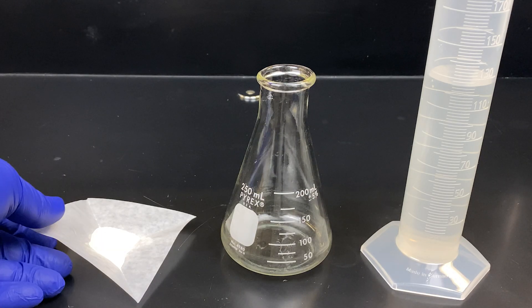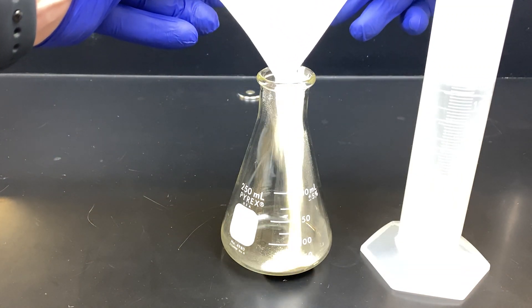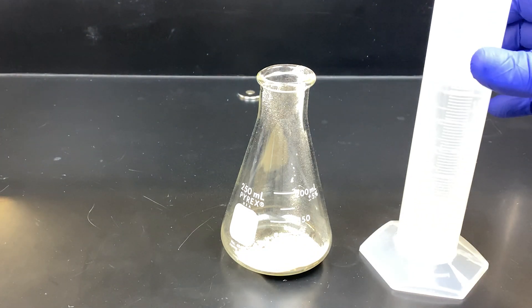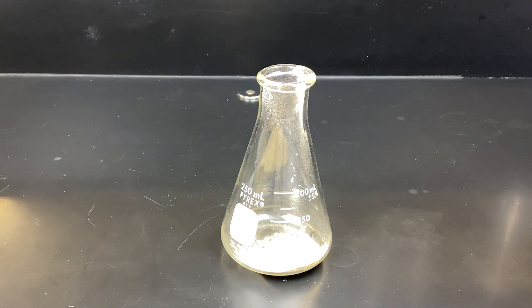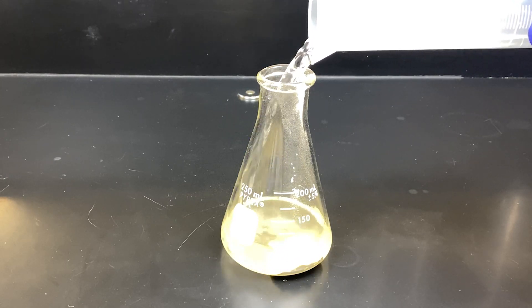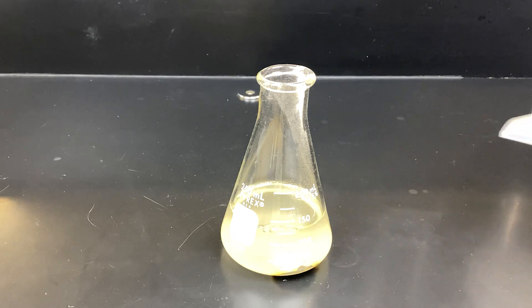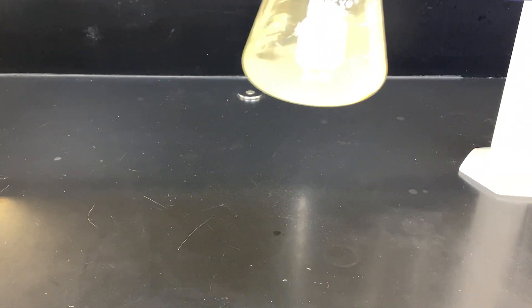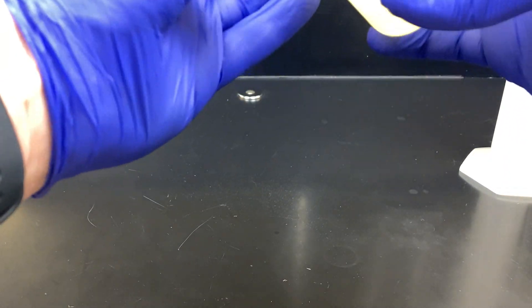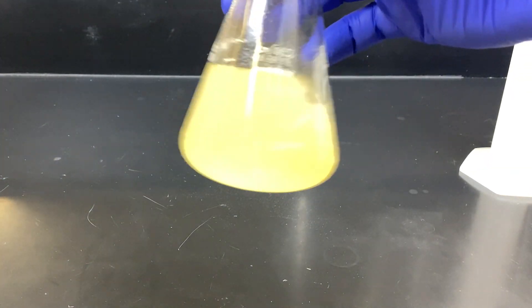Here I've measured out nutrient agar on this weigh paper. We'll place it into an Erlenmeyer flask for mixing. We're making a 2.3 percent weight by volume solution. Here we have water — we'll pour some in. We're making enough to make five plates: 125 mL of water being added to the powdered nutrient agar. Nutrient agar needs to be warmed to dissolve in solution. It is currently not dissolved in the water; it is suspended in the water.